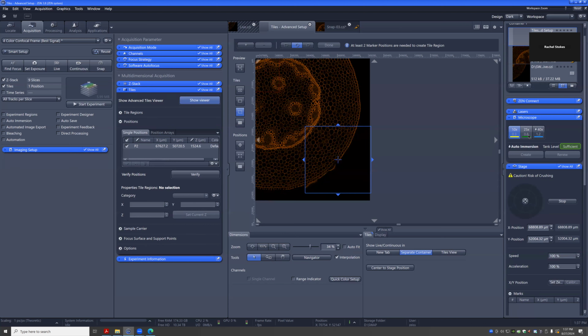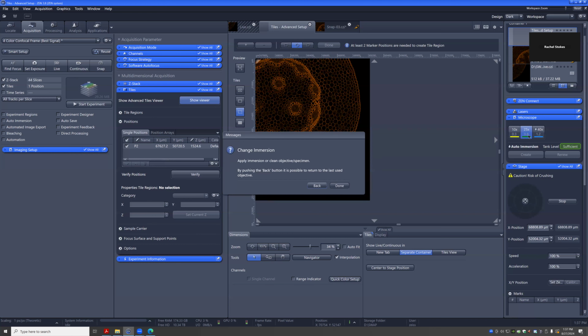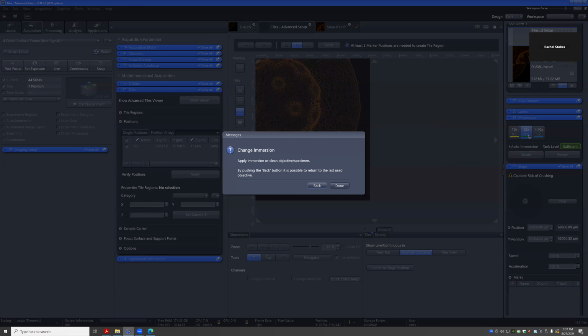And if you look at the, you want it on water? Yeah. Okay, so we should look at that then. Look at the correction color. We can adjust that for just setting it on the water setting. Will people use, because people will do some oil imaging, I assume, or is it, the 25, no one will do it on the 25?